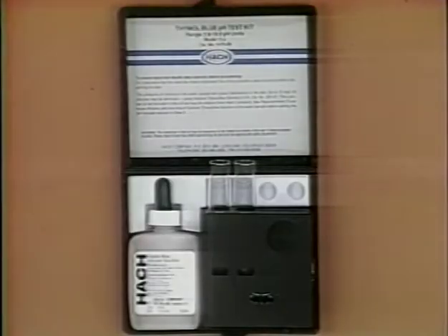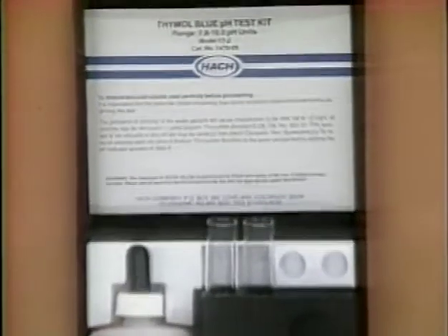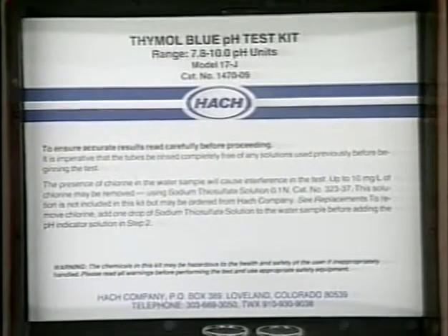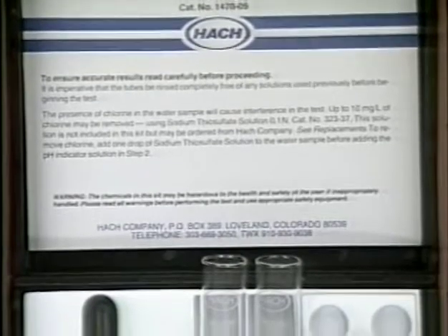Hold the comparator up to the light source and rotate the disc until the color on the wheel matches the color in the sample. Read the pH through the scale on the window. pH may also be measured using a narrow range method. The smaller range allows for more accuracy. There are several narrow range kits available, but the most common is the Thymol Blue test, which measures pH values between 7.8 and 10, which are the most common pHs in pond water.